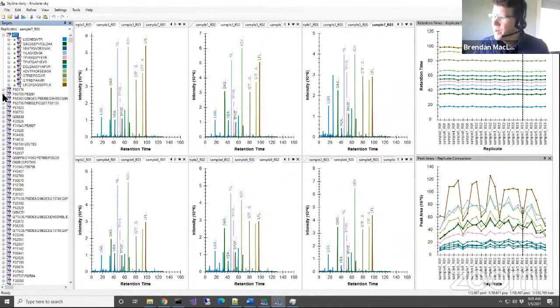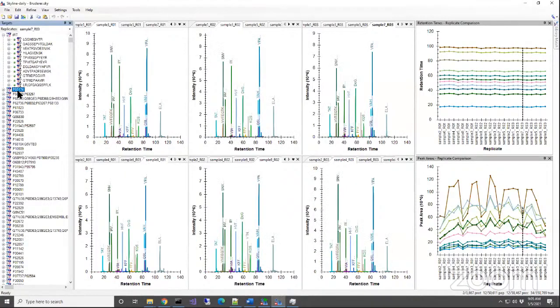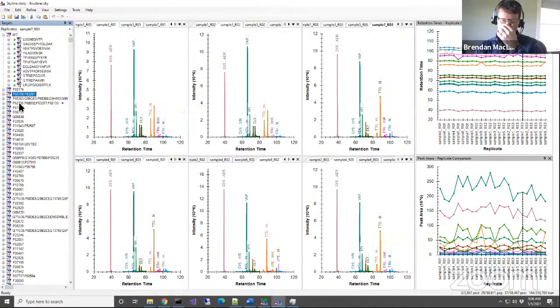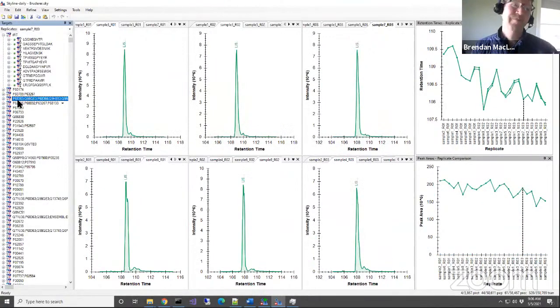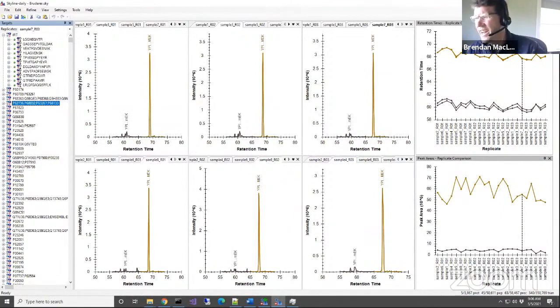Okay, so any other questions that you want to throw in? There are two, but there's a lot of steps that have been skipped before this. How do you load MS data into a Skyline document? Okay, so if you've missed Monday and Tuesday, for that question, do a tutorial. That's all I can say. That's a little bit too basic at this point. Anything else? Not for now.